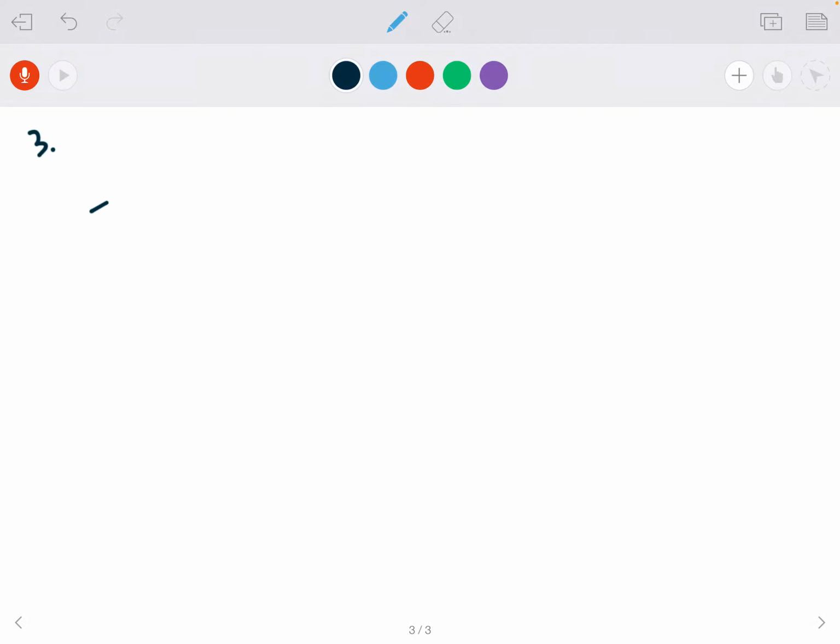Example 3, I'm going to put in here, is similar to the initial NMR spectrum that I showed, an alcohol. This would have 3 signals. The hydrogen there is 1, 2, and 3. I wanted to bring this up because hydrogens on either a nitrogen or an oxygen, they don't always appear in the NMR spectrum. So that's just something to note. They aren't always going to appear.